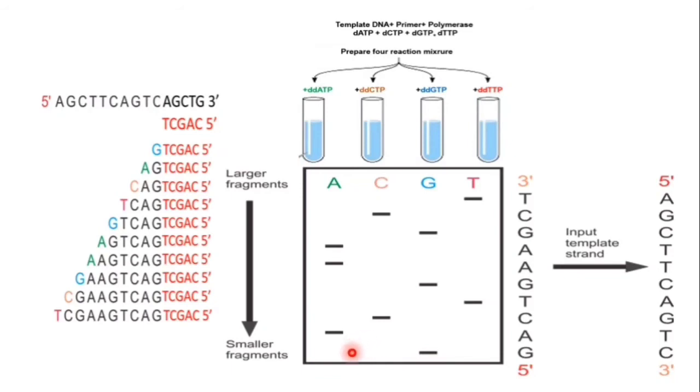Here you see the G tube after running the gel. We expose this gel for autoradiography, and in that autoradiography film we will find the bands.